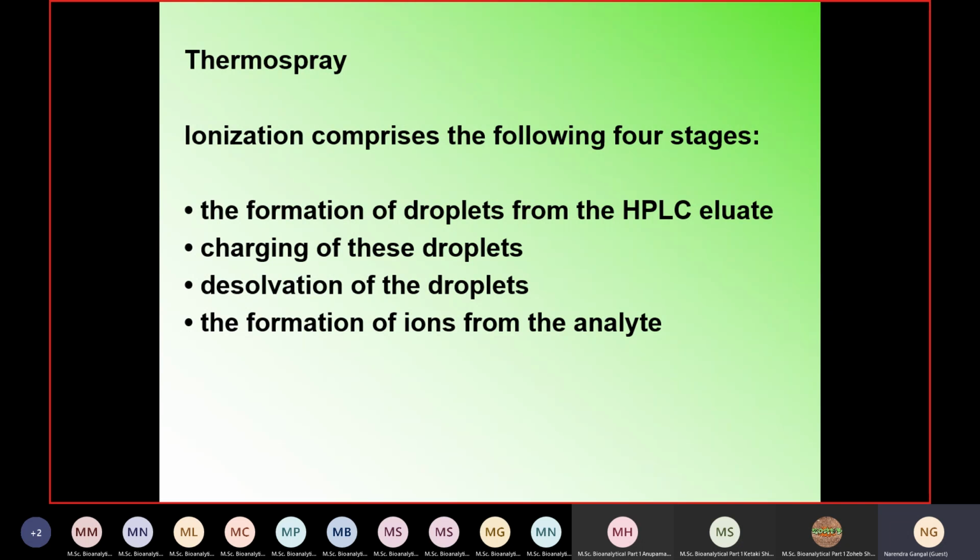The first stage is the formation of the droplets from the HPLC eluate. Have you learned atomic absorption spectroscopy, AAS? Yes, sir. What is the first step in AAS? Atomization of sample. Nebulization. Absolutely. The nebulization and atomization of the liquid that you are pumping.